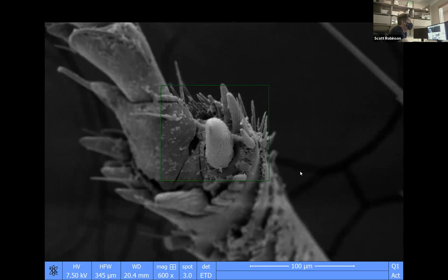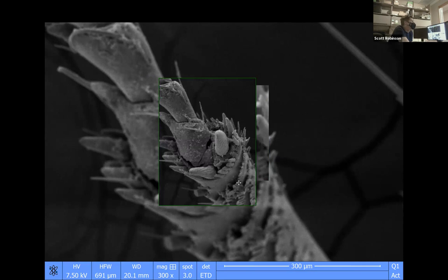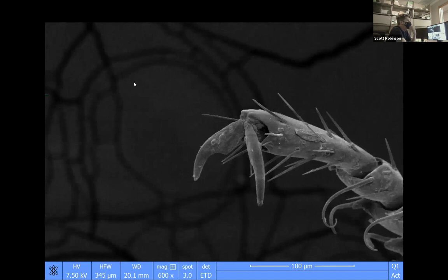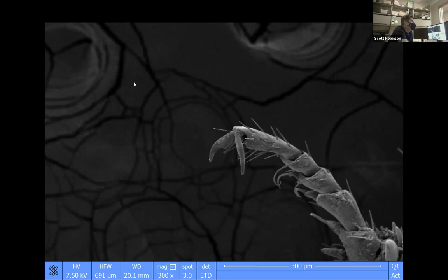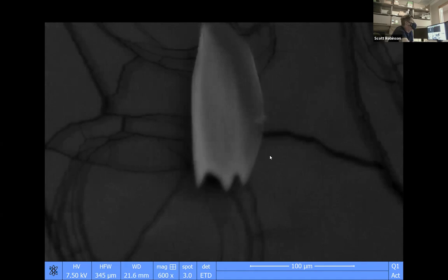And I saw this the other day, and I don't know what it is. It looks like it's probably one of those hard setae, like the setae that we saw that are used on the ambush bug. And then these are insect claws. So the claws, there's a sort of tendon inside called an unguitractor. And when the unguitractor pulls backwards, the claws close, and then when it lets go, the claws open again. And we can see down here is a wing scale. Somebody's wing scale fell off.